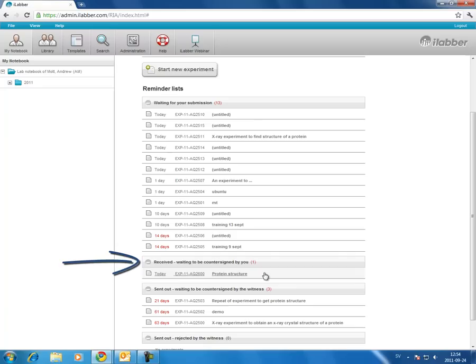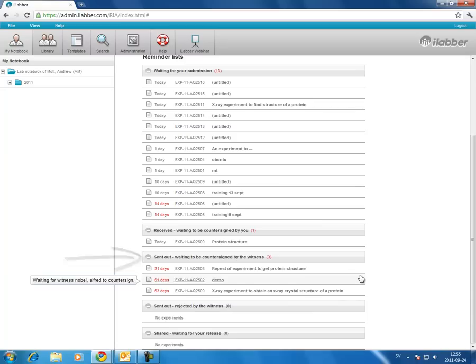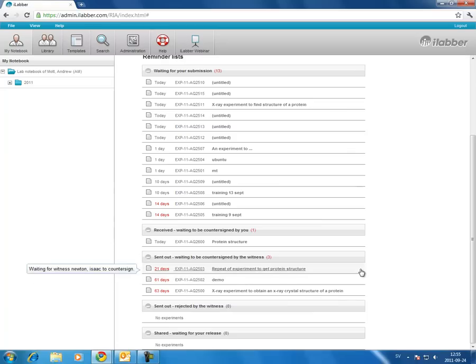Underneath that is a list of the experiments sent to you for witnessing. All you need to do is click on this link, read the experiment, and countersign it. And then under there is a list of experiments which you've sent out to be witnessed, so that if needed you can go and remind the person to witness these experiments.